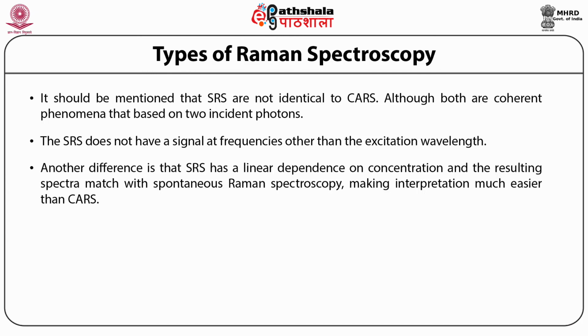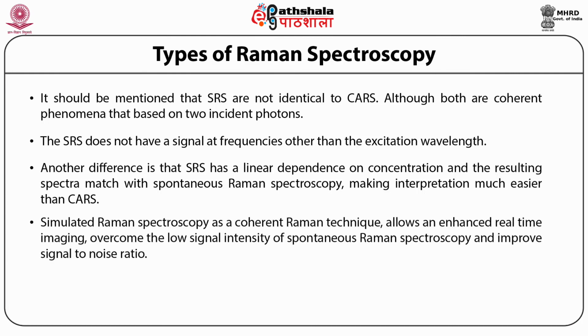Also, the SRL and SRG only occur if the frequency difference matches a molecular resonance. Stimulated Raman spectroscopy, as a coherent Raman technique, allows enhanced real-time imaging, overcoming the low signal intensity of spontaneous Raman spectroscopy and improving the signal-to-noise ratio.